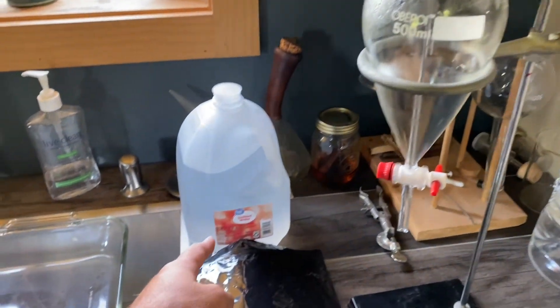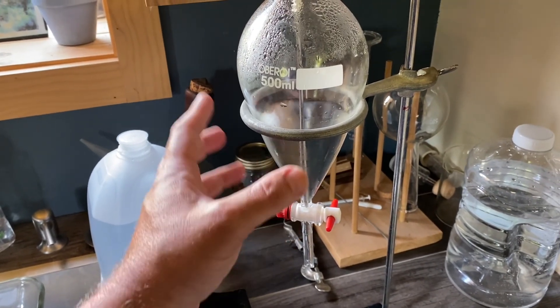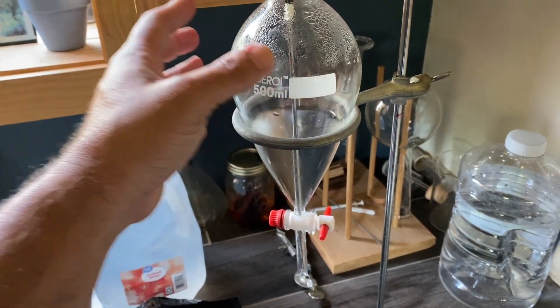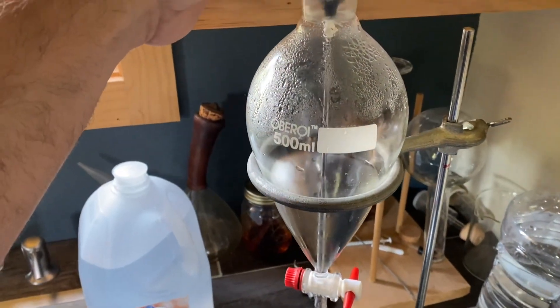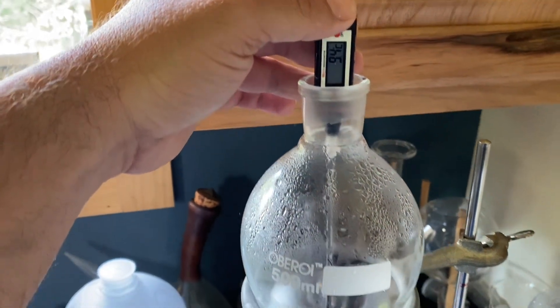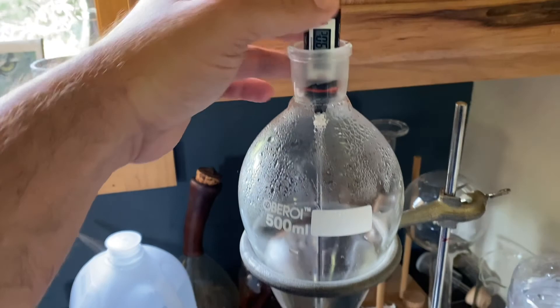You want to have some distilled water. Put about 200 milliliters of distilled water into the separatory funnel and then preferably chill the whole thing overnight. It's sitting here at around 9 degrees Celsius, so it's chilled.